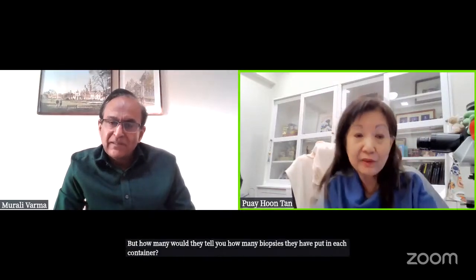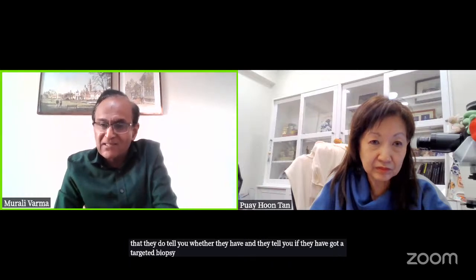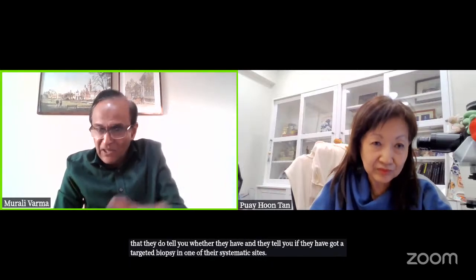Yeah. But would they tell you how many biopsies they have put in each container? Yes, they would. They would indicate. And sometimes it fragments, and we mention in the histology that it is fragmented. So they would tell you that number. I think that's the important thing, that they tell you if they've got a targeted biopsy in one of their systematic sites. So they would let you know.